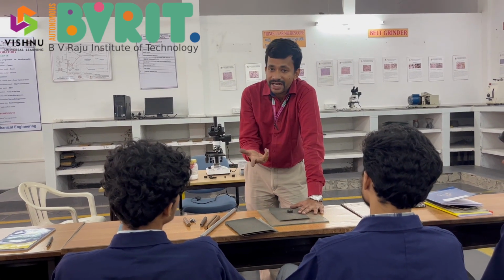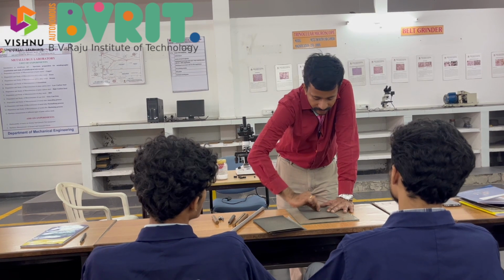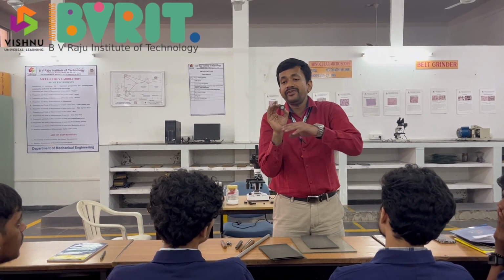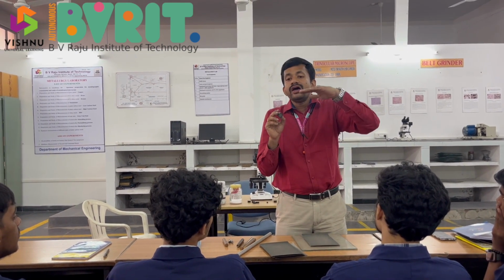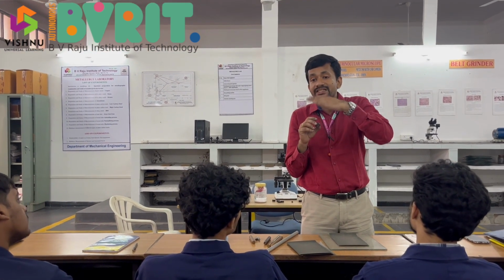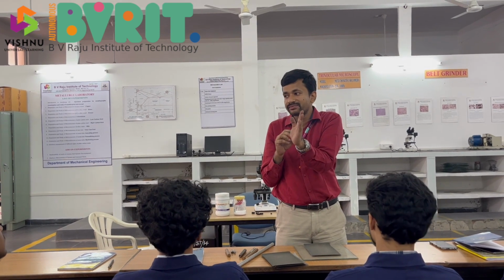So how do I remove the scratches? Start from one end and then move forward and bring back to the first position and then move it. So this is how you need to do. When you are doing this, I am not rotating. I am keeping only in one direction, and that direction is perpendicular to the larger, deeper scratches. For example, there is a deeper scratch like this. That means I am moving perpendicular to the deeper scratches so that these deeper scratches will be gone away, and then all your scratches, if at all they are visible, will be oriented into one side, that is this.